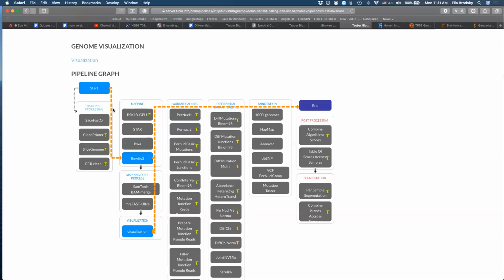So what are we doing here? We are trying to visualize reads. I think if you just walk through the steps that I'm doing, you will start understanding the logic of why we are aligning the reads to the reference genome, and what we can see in the reference genome, and what kind of biologically meaningful information we can get out of this kind of processing pipeline. So let's take a look, and then we will return to these excellent questions that you guys have.